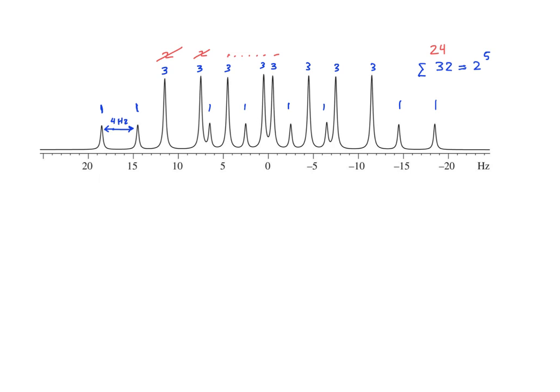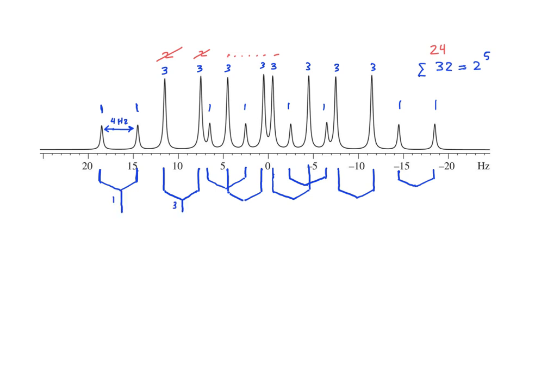Then we find the other 4 hertz differences. And I've done this quickly. And now we assign relative values to each of these pairs. Once we reach a midpoint, I think it's a little bit easier to complete the series.